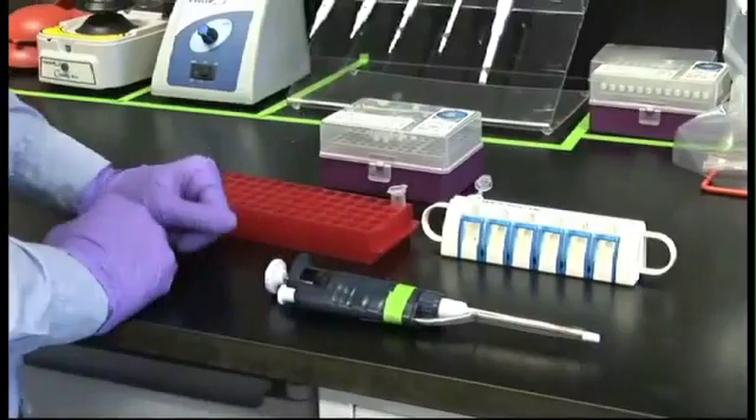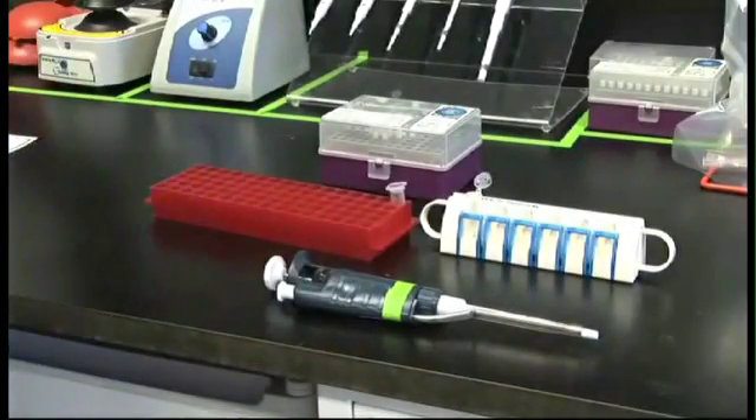This is the final sample, cleaned of extraneous material and DNA below 100 base pairs.